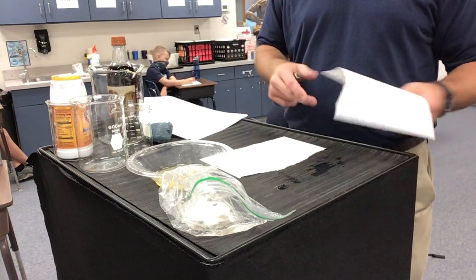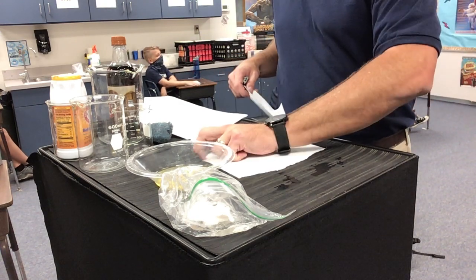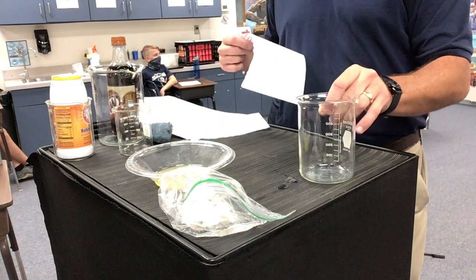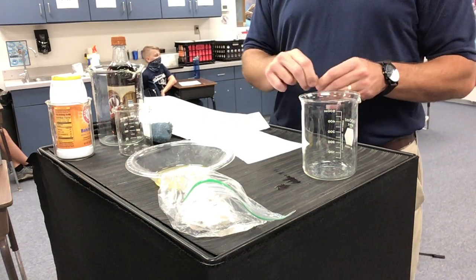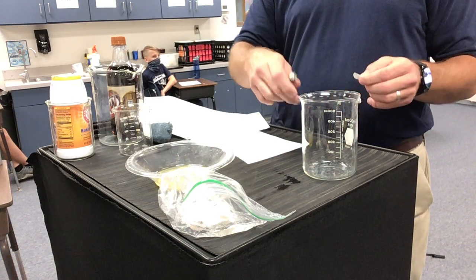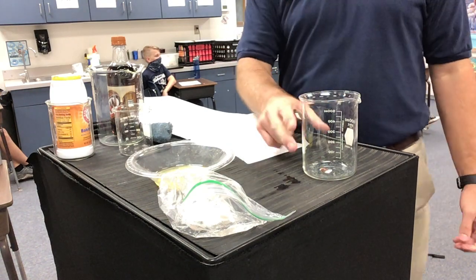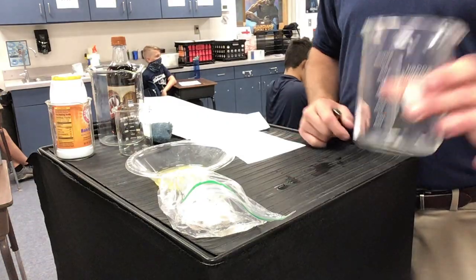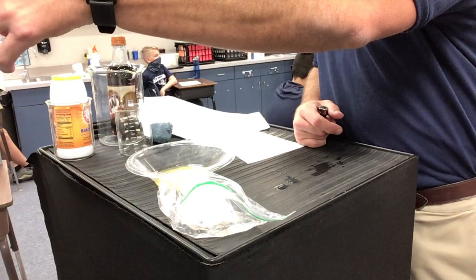Taking that piece of paper. Our next one is going to be taking that paper very carefully. I'm only going to take a little piece so I don't set off the smoke alarm. Okay. Again, there you go for online people. For those here in class. This is burning of paper.